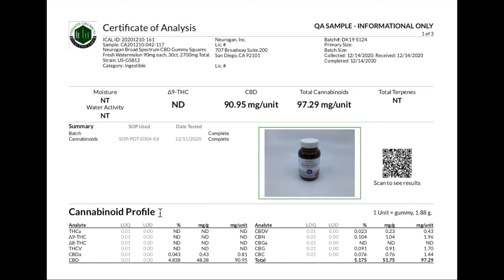As we can see here, this product contains not only CBD, but CBD-A, CBD-V, CBN, CBG, CBC, and more. The holistic purity of the hemp used by Nuragin becomes evident in this third-party lab test.